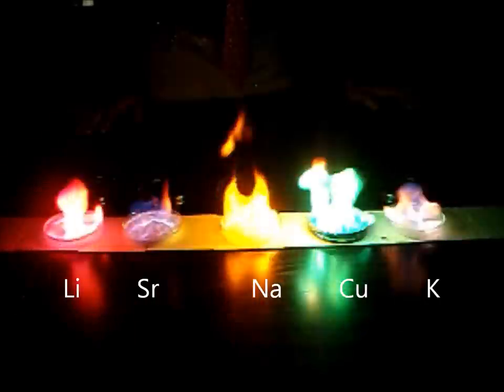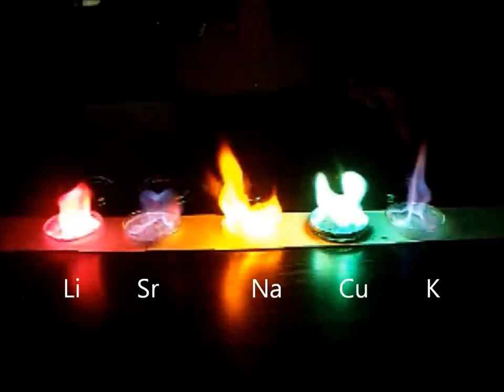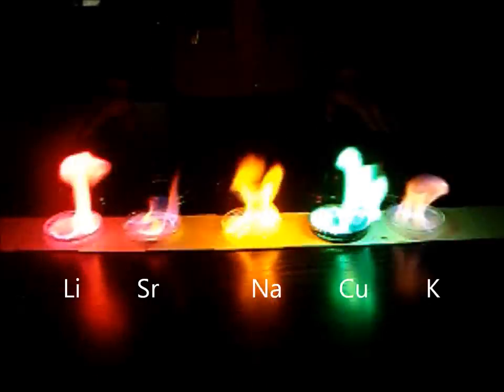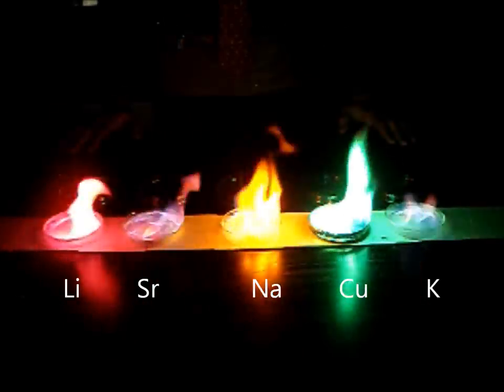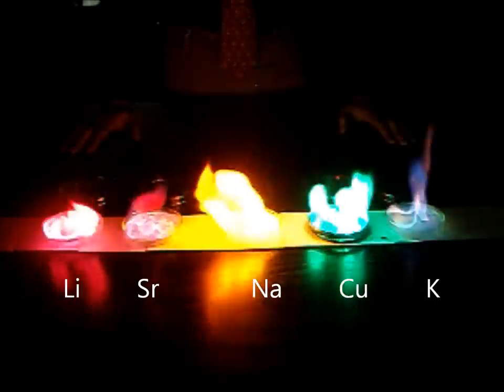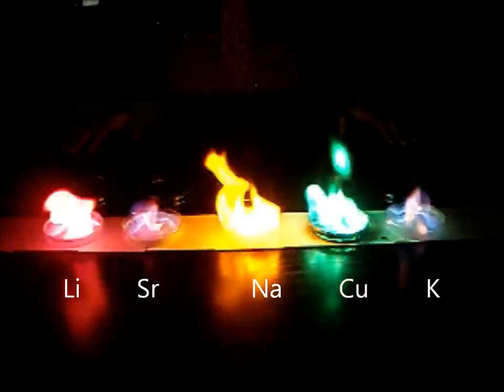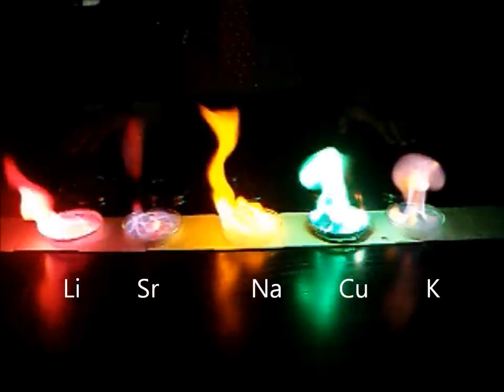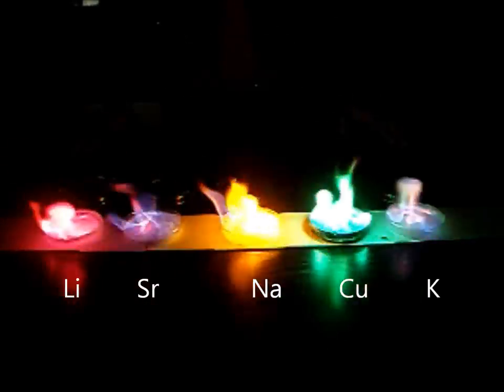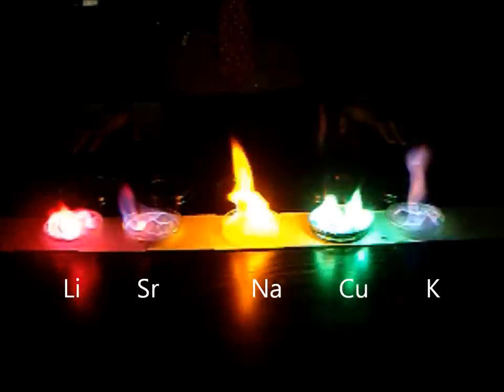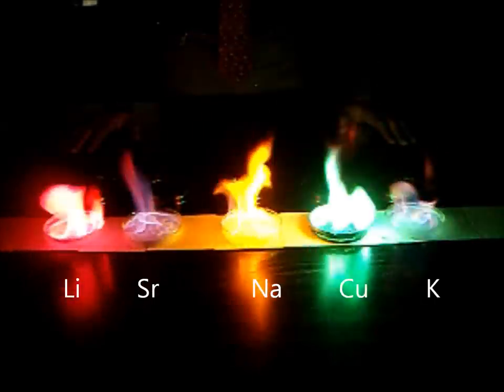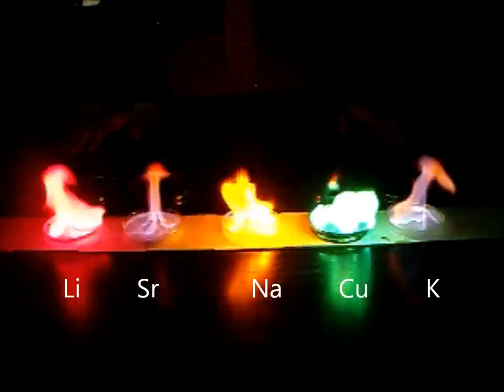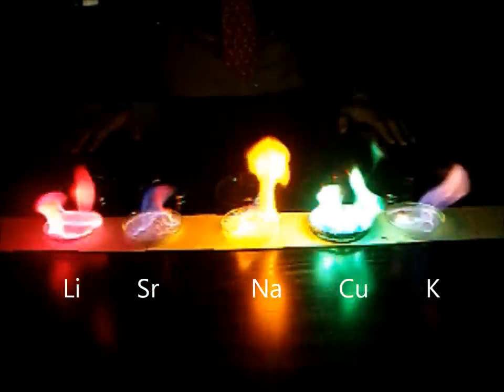Okay, you want to ignore that orangish tone that you see. The whole reason why these five different metals give off five different colors is because the metal, as the methanol burns, is gaining energy. The outside of the metal has electrons on it, and that's what's actually gaining the energy. So the electrons jump in energy level.